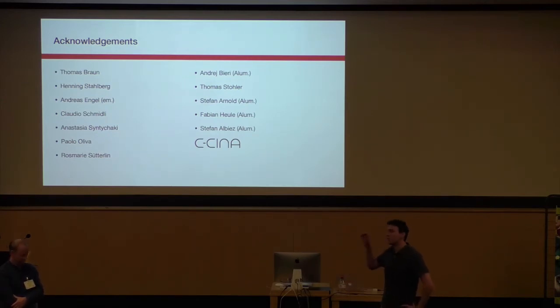So first thing would be with the laser, you can measure the laser absorption, which gives you an indication of how thick it maybe is. The other thing is, you try to withdraw as much as you can, of course, and then what is pretty crucial is the temperature of the grid. So you control the temperature of the grid, and depending on the dew point which is around the grid, this gives you a small evaporation, and by tuning this evaporation rate, you can then also tune the thickness of your final sample. Yeah. But it means the concentration could vary during that process. Yeah, there is a small amount of evaporation, not a lot, but of course, the concentration is going a bit up there, for sure.